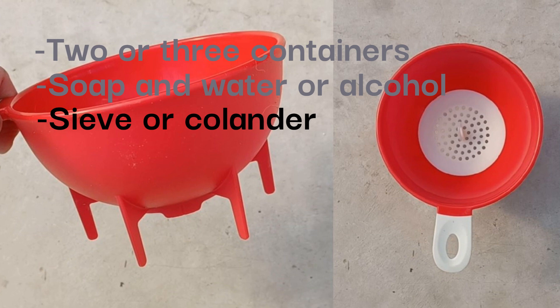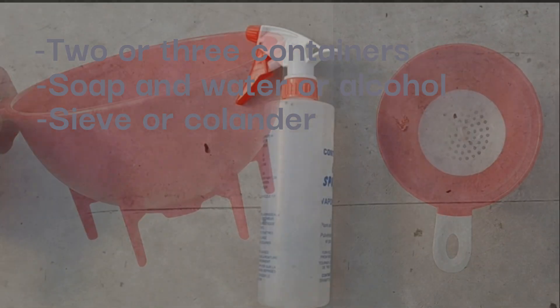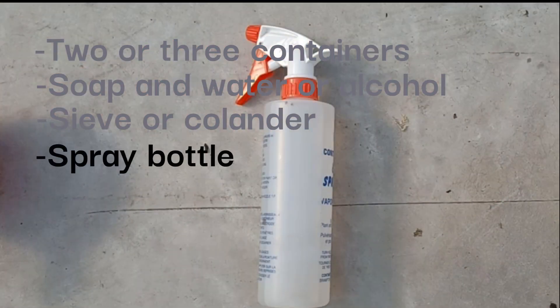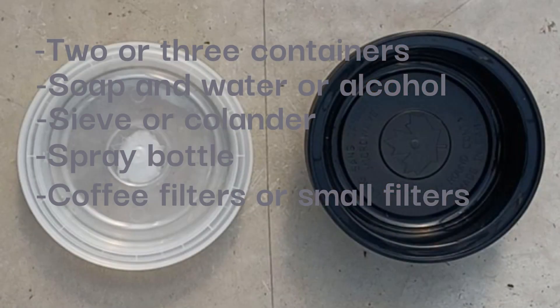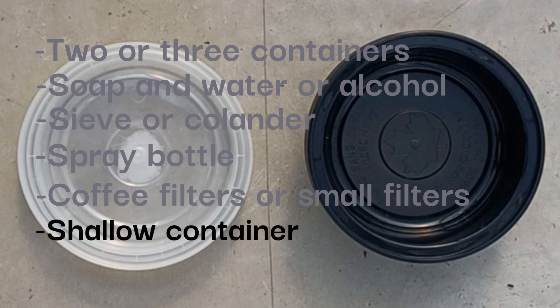The size of the holes on the sieve are not important. You'll also need a spray bottle to spray bubbles down and get any remaining insects out of the jar, and coffee filters or small filters to catch the insects. Try to match the size and shape of the filters to the type of sieve or colander you have. Lastly, you'll need a shallow container like a deli food container that is wide enough to hold the coffee filters so you can look at them later.